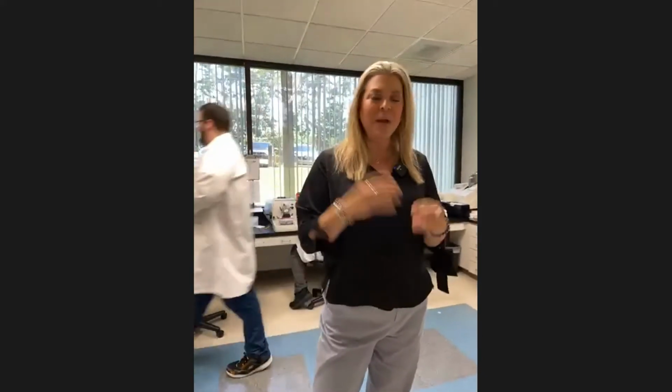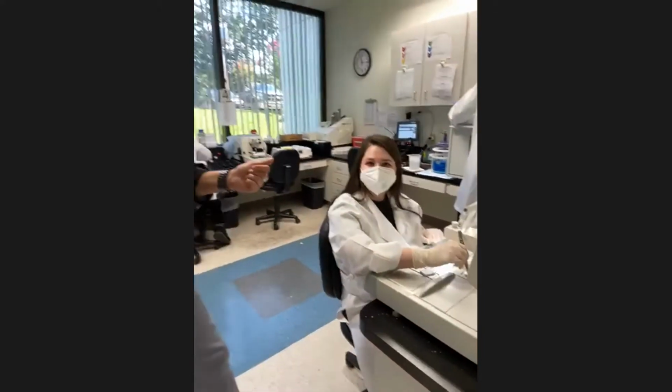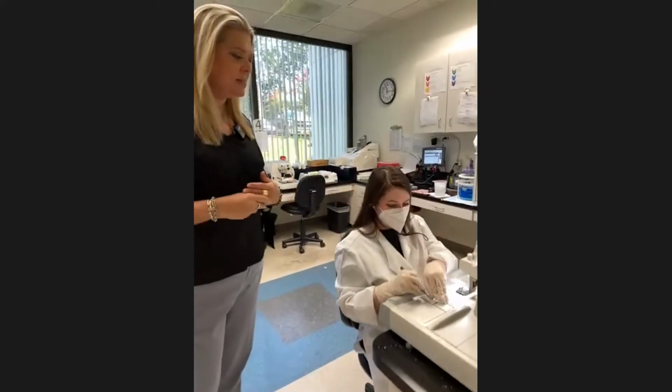We take that tissue, and the first thing we do is a process called embedding. We have to get that tissue in a form that we can cut through in order to get it onto a slide. So the first step is embedding, and this is Kaylee, a lead here in our light microscopy area. So Kaylee, tell us what this part looks like.